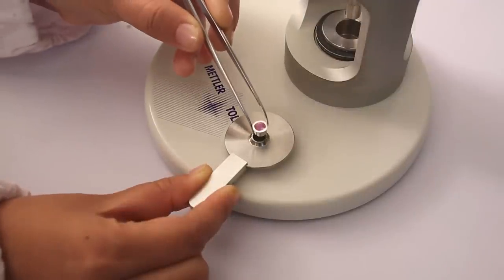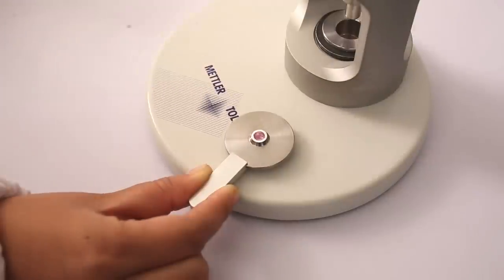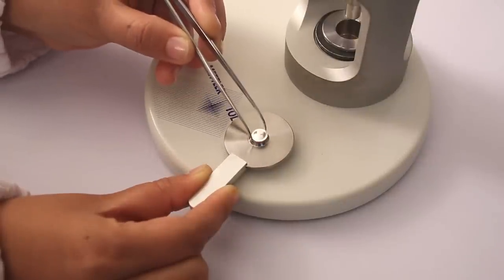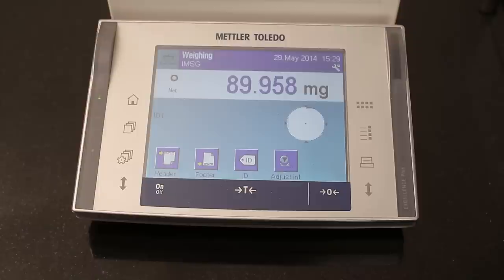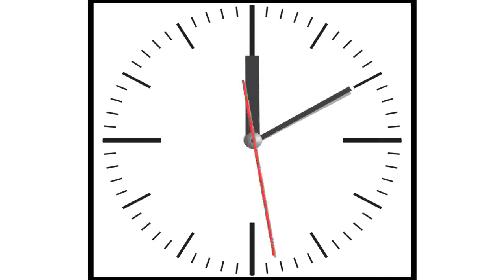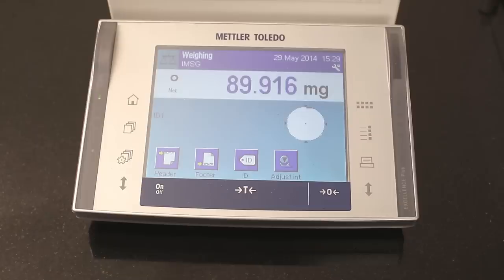Cold weld the lid to the crucible and check the weight gain. Leave it on the balance for some time. The crucible is tight if the weight does not decrease by more than 20 micrograms within 5 minutes.